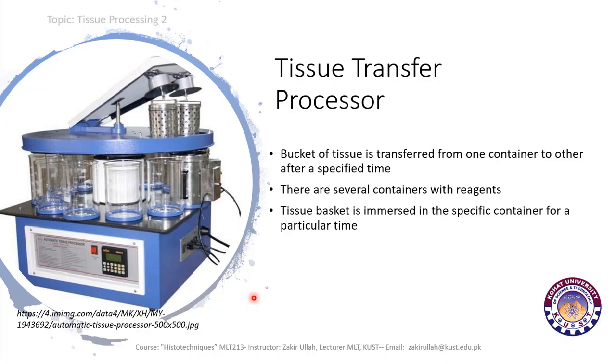The basket in which the tissue is present is immersed in the specific container for a specific time.